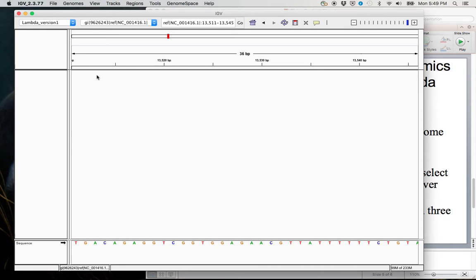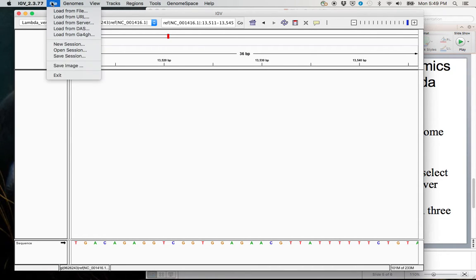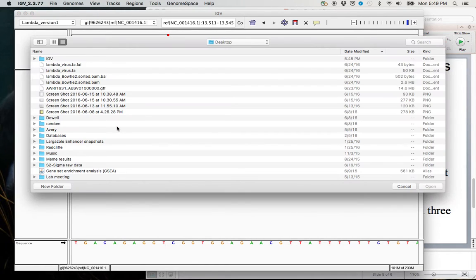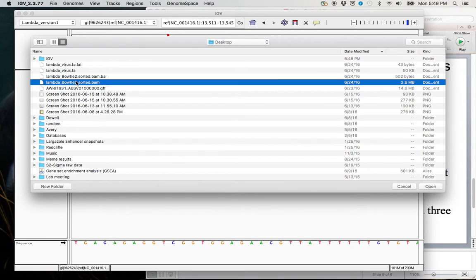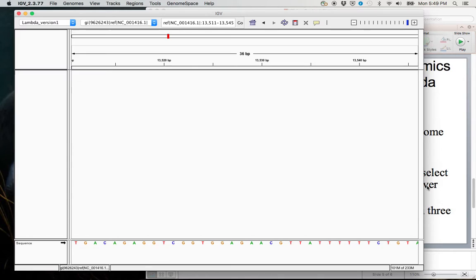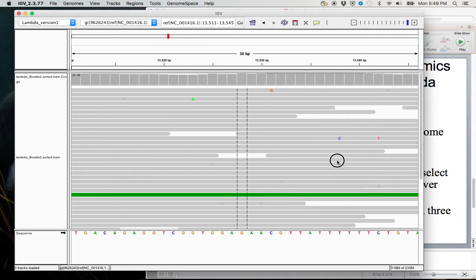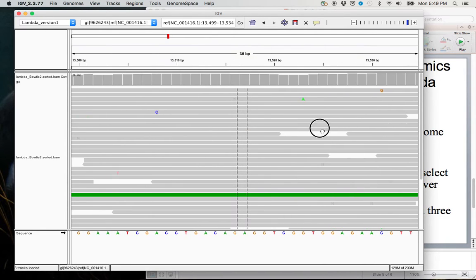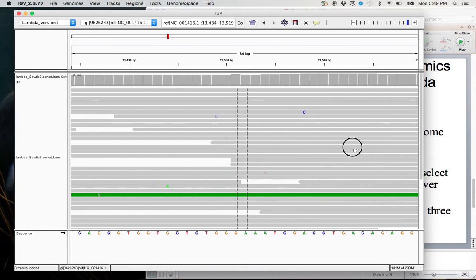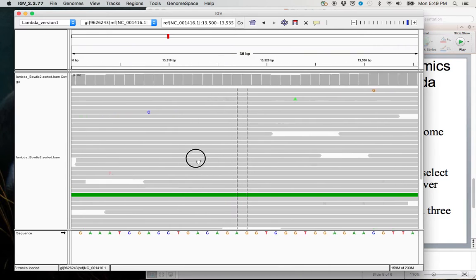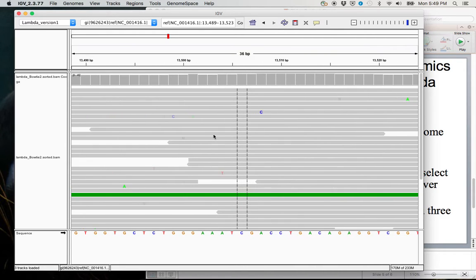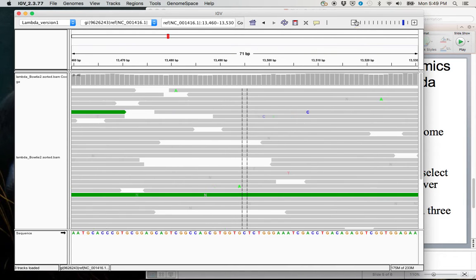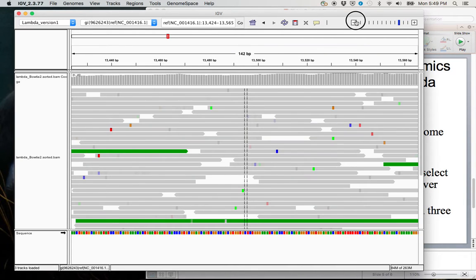However, this is no fun. We want to look at the reads that we just mapped. So in order to load the reads, we go file, load from file. And we're going to want to grab the lambda bowtie2.sorted.bam file. And now we can actually see where our reads are mapping. Again, I'm just clicking and dragging left and right here. Really, IGV, you just got to play around with it a little bit.